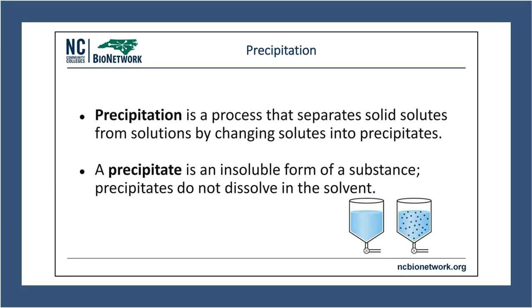So, for instance, I'll give you an example. Let's say that I've got a beaker, and this beaker's got a solution in it. I don't really know what that solution is, but the company has deemed it hazardous. And the reason that they've deemed it hazardous is because there's silver on the inside, and silver cannot be dumped down the drain. Silver cannot go down the waste disposal. Silver has to be treated as a hazardous waste, which means that we're going to have to pay someone to come in to take that waste from us and dispose of that the proper way.